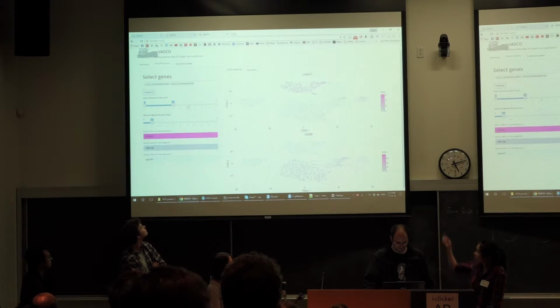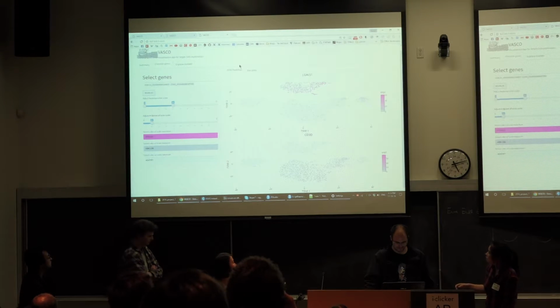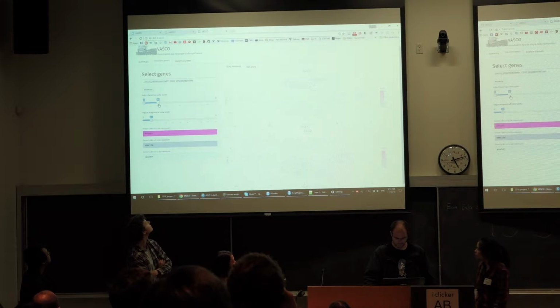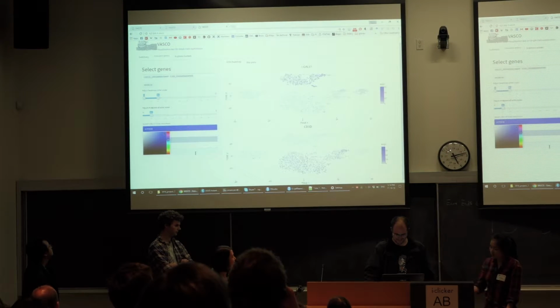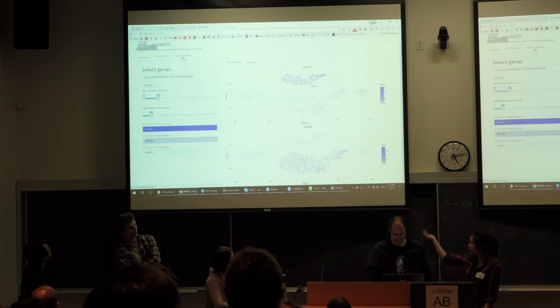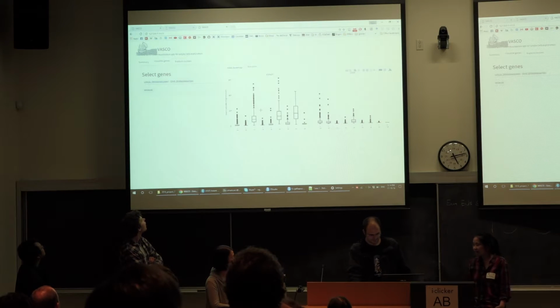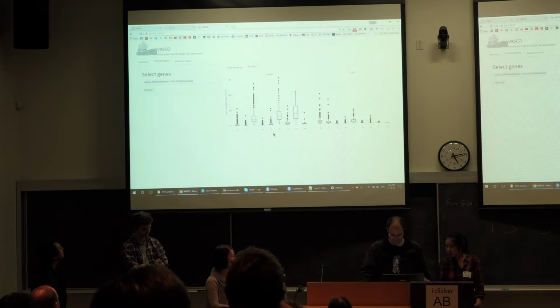What Ogun just demonstrated is that in our tool we can select multiple genes to compare. We can select up to 4 genes, and you can change the color scale to, let's say, a maximum of 0.2 to increase the contrast. We can also change the color to try to visualize the different populations. And so CD3D is a marker for CD4 cells, and so we might infer that this is associated with CD4s. Also implemented is a box plot feature, which shows the level of expression of the genes per cluster. And in addition, we can also save these figures.